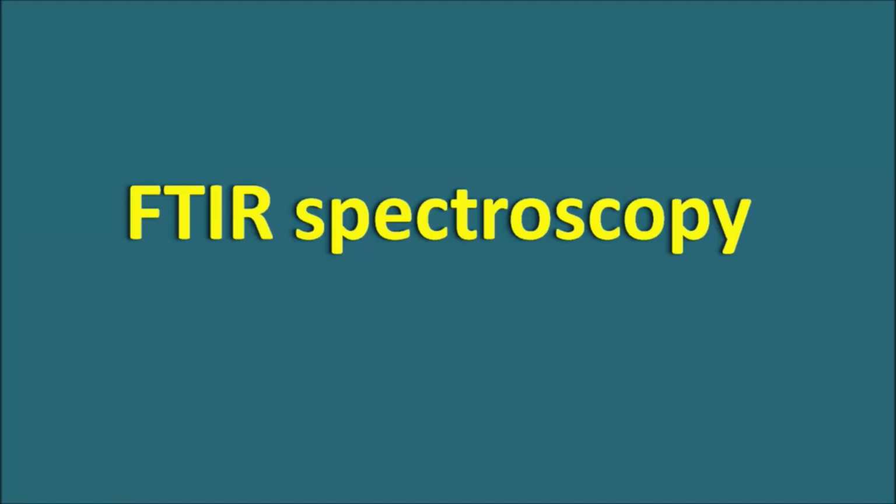Hi everyone. Today in this video we are going to discuss FTIR spectroscopy, Fourier Transform Infrared Spectroscopy. What is the principle behind this FTIR? What are the instrumental components? And what is the Fourier transformation? All these things we will discuss in this video.